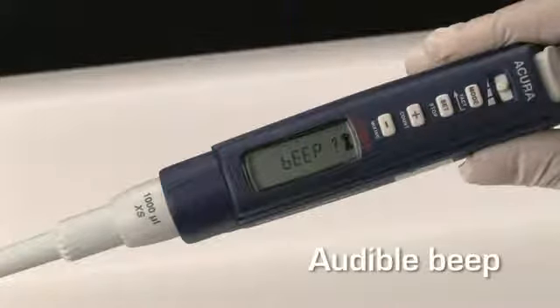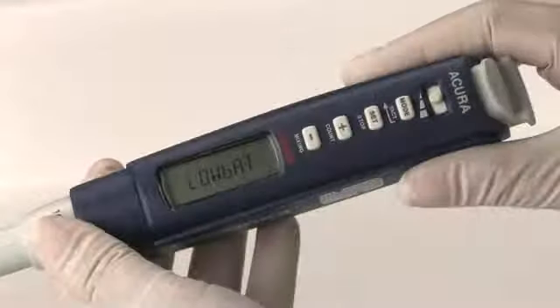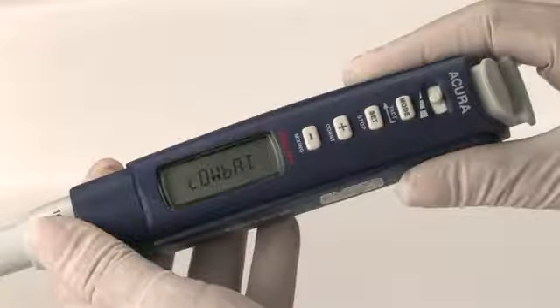The audible key beep can be turned off anytime. The battery indicator will display power level. When 'low bat' is displayed, the pipette needs to be charged or the battery changed.